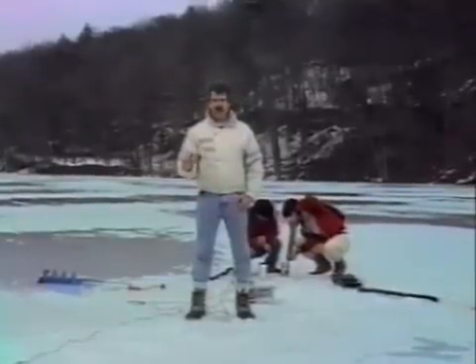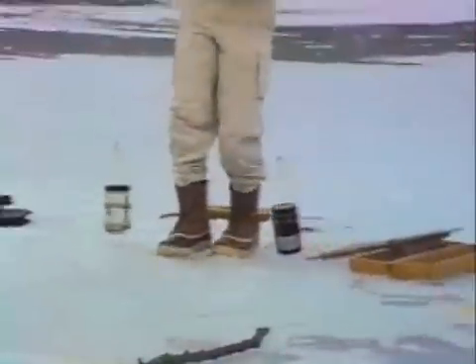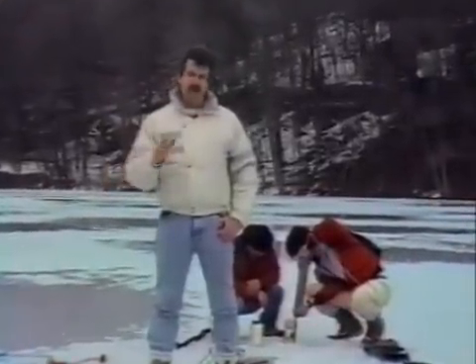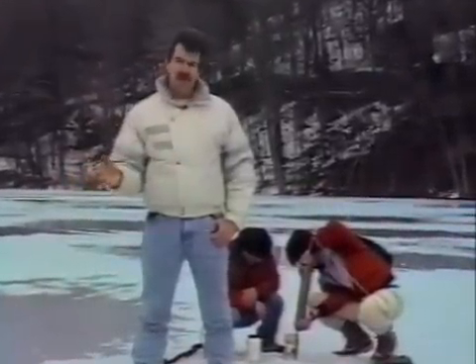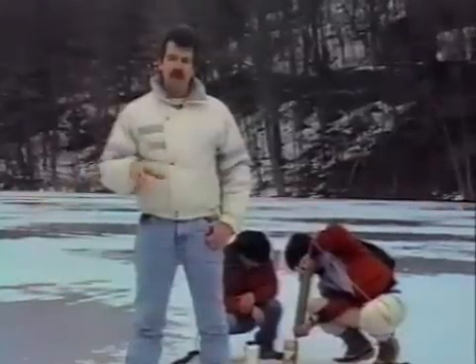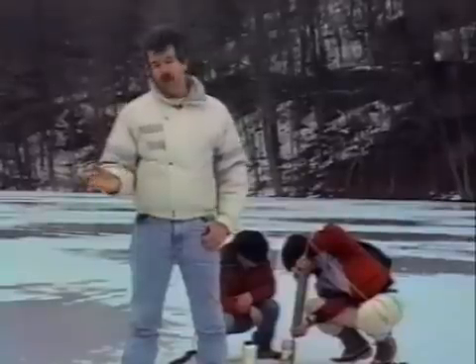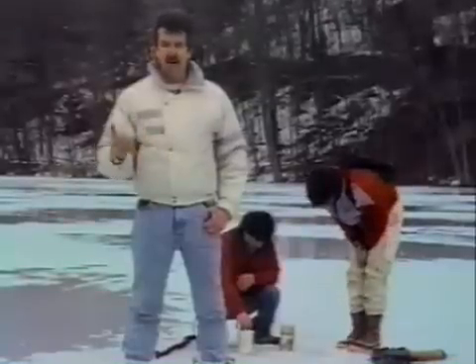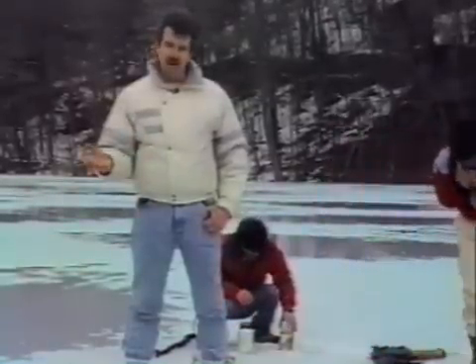Basically what is involved is taking a couple of bottles — one that's completely blackened so no light can penetrate, and a clear bottle. Whatever depth you want to test the level of photosynthesis versus respiration, you remove a sample of water from that depth using the water sampler. The water is then placed in the bottle, and an oxygen concentration reading is taken for each bottle and noted, then these bottles are lowered to whatever depth of water you wish to work with.